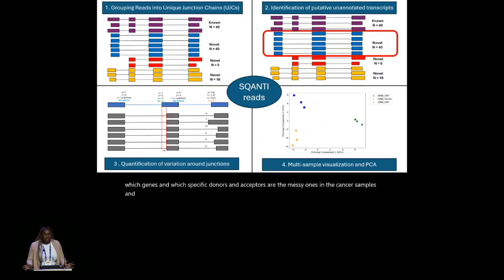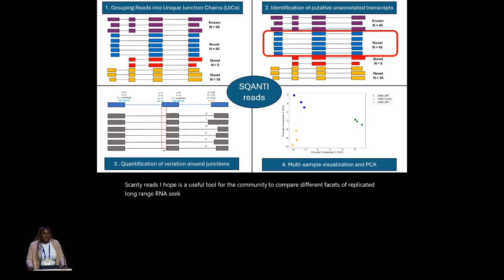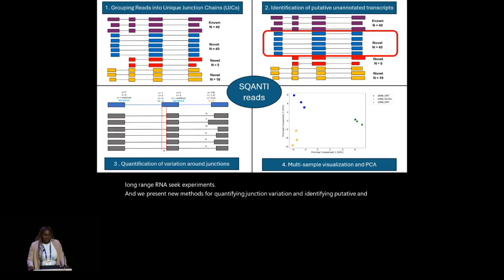And so in conclusion, SQANTI-reads, I hope, is a useful tool for the community to compare different facets of replicated long-read RNA-seq experiments. And we present new methods for quantifying junction variation and identifying putative unannotated transcripts.